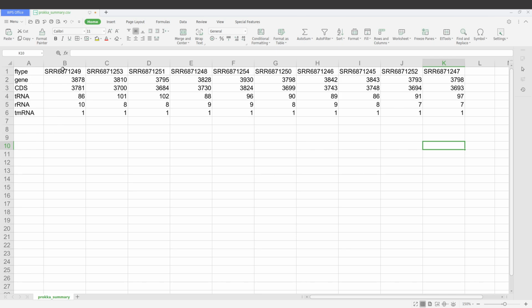All right. So if you had a reference sequence, you can also add it and then compare and see the differences. And that will let you know what genes are present or absent in the sample that you have compared to the reference sequence. So this summary gives you an overview, and then you can explore further by inspecting the individual outputs.